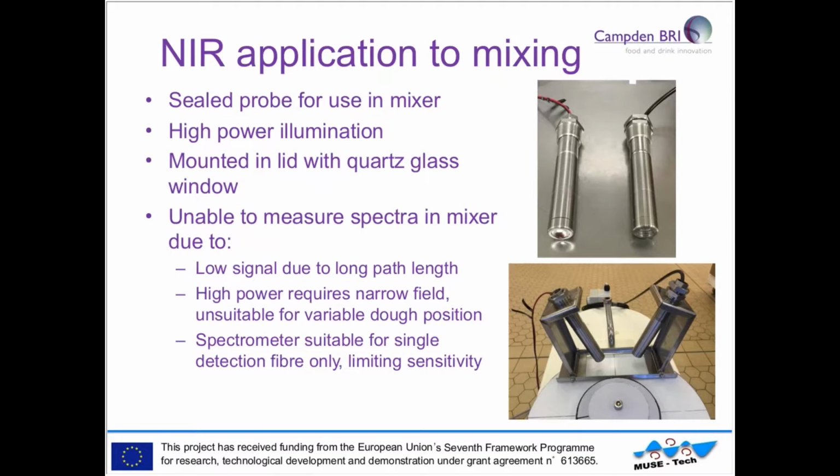So moving on to that, one of the issues that we had of scaling up to a large mixer is getting enough signal back to be able to measure a spectrum. We've built a separate probe that is sealed for use with the mixer, and to deal with this power issue, it was designed with high power illumination, so there's a focused light source aiming down into the mixer. We've mounted it over the lid of our mixer, shining down through a quartz glass window, which is transparent to NIR over the full wavelength range.